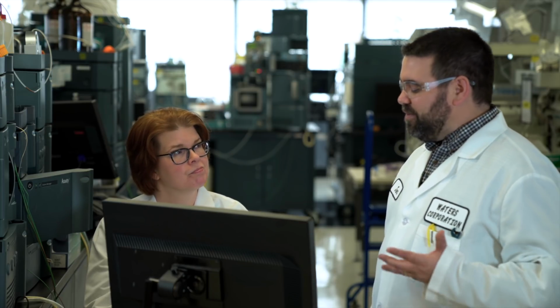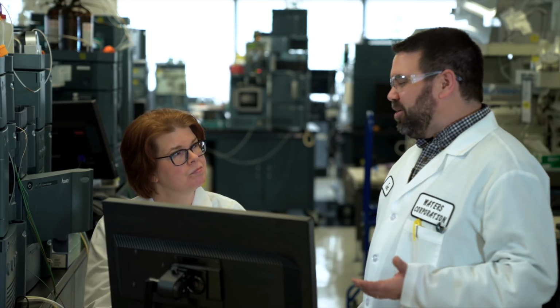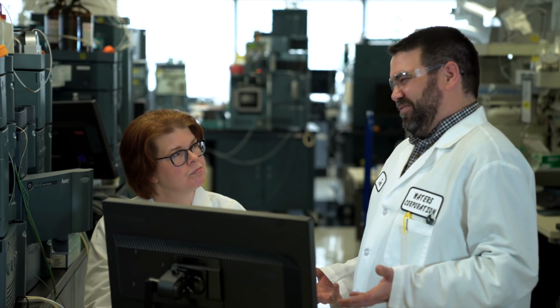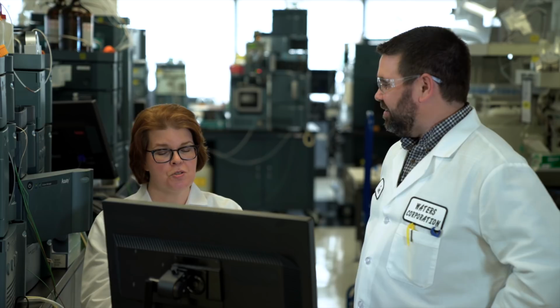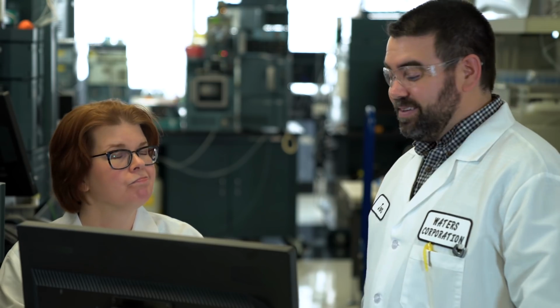Yeah, Kim, there are so many other factors in the chromatography and the base particles that dictate the overall retentivity of the phase. Like you said, we talked about phase ratio, pore volume, surface area. If you're not familiar with all this stuff, it's kind of confusing. It is. So when you're trying to choose a column, if you're looking at USP designations, like the L1, or if you're looking at percent carbon, it really just doesn't tell the whole story.